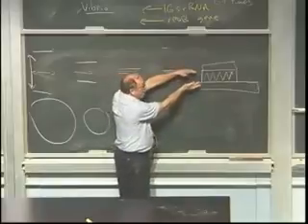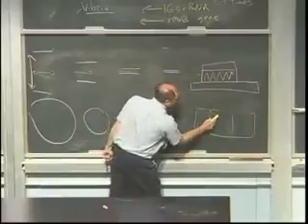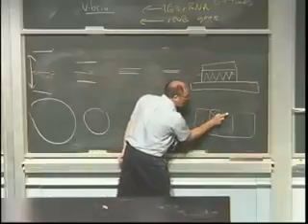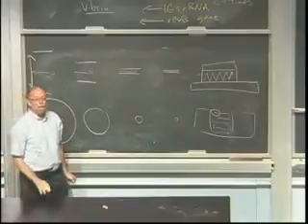So by using the lowest power, I can get the entire column of liquid in place. Then looking again from the top down, when I have that slide like this and that cover slip, I have a circle like this. The way I find specimens, I just move that field of view like this, and I just keep doing this, back and forth. It takes you no more than 30 seconds to scan the entire slide. It should never take you more than 30 seconds to find a specimen.